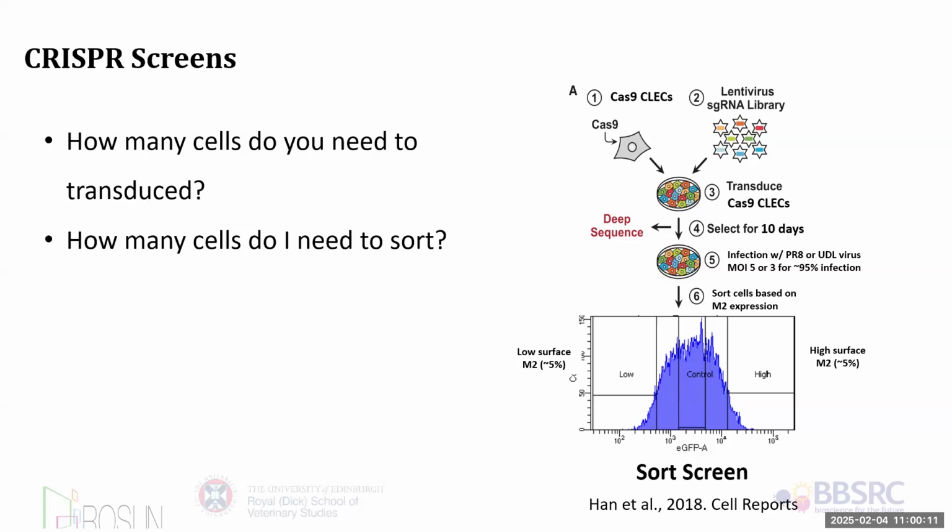And it's all to do with getting statistical power. So the answer, how many, is always as many as you can, but there's a practical trade-off between the two. You can't be sorting for 7 days. Maybe you can at the Broad Institute, but most places you can't be sorting for 7 days, and your cells are not going to be happy after that time anyway.